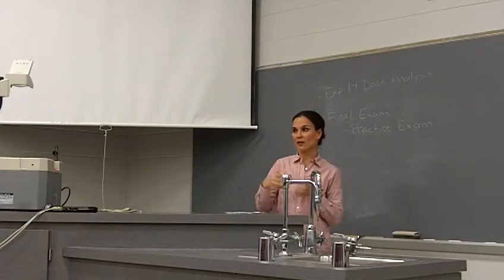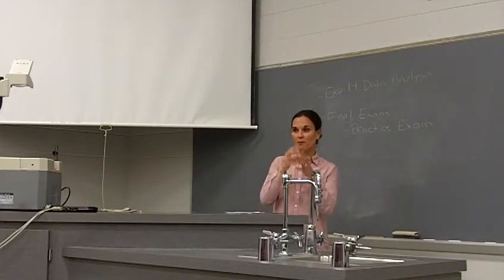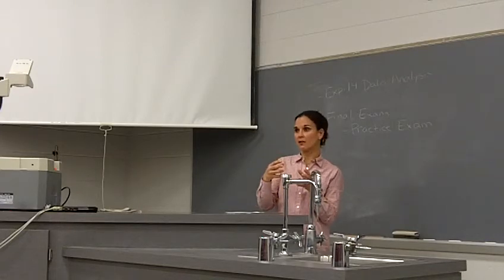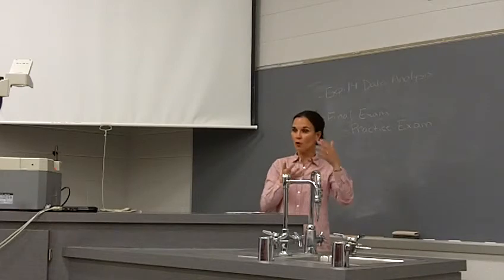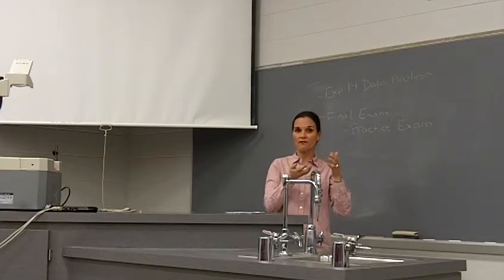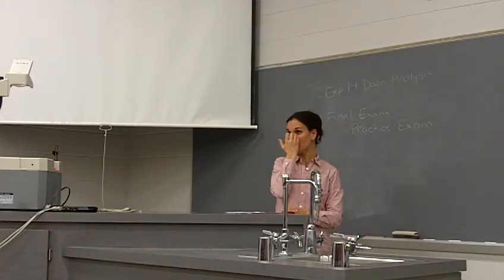So remember that you want to use your own GC data to figure out what percentage of your GC data was product and multiply that times the yield that you calculated last week. Because remember, you measured just what the total mass was of the mixture at the end of working it up and drying it. Now you've got to figure out how much of that is product, figure out what part of it is product, and then go back and calculate a percent yield from that, okay?